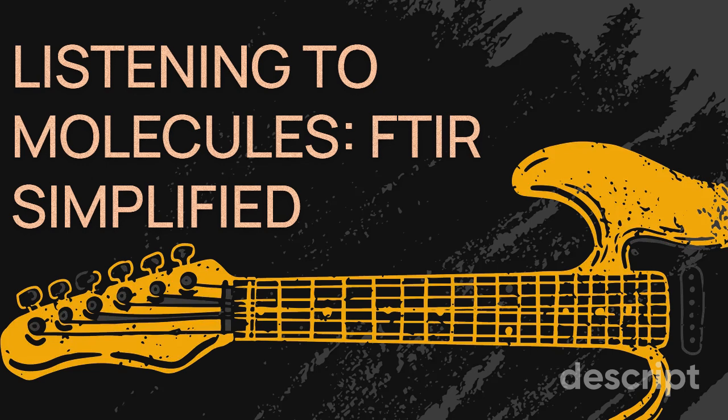Now, before we dive deeper into protein structure analysis, I'm curious, what are some of the real-world applications of FTIR? Oh, FTIR is incredibly versatile. It's used in a wide range of fields, from forensics to environmental science to pharmaceuticals. It's used to identify unknown substances, determine the purity of samples, and even analyze ancient artifacts. It's amazing how this one technique can be applied in so many different ways. But for this deep dive, we're going to focus on how FTIR helps us understand proteins.